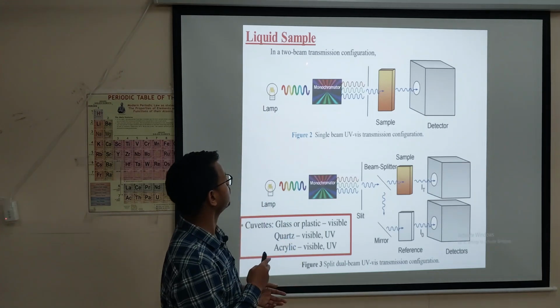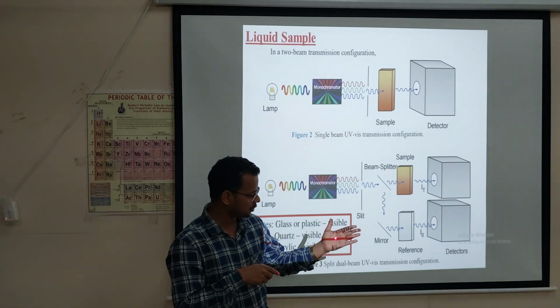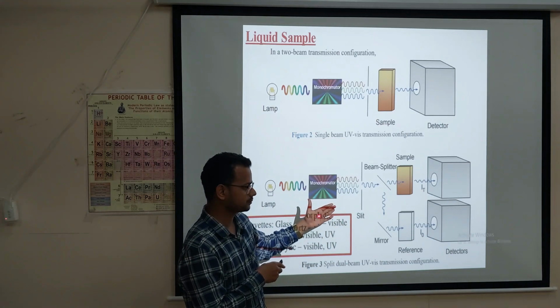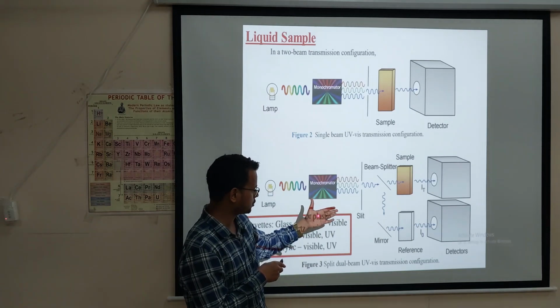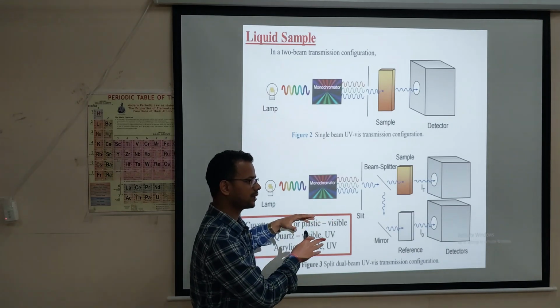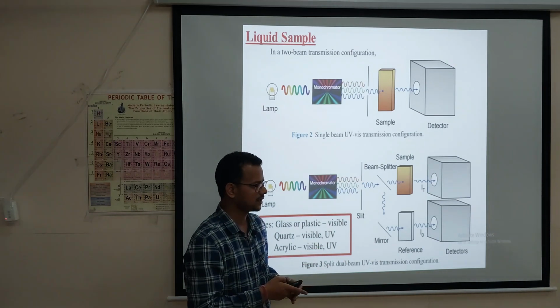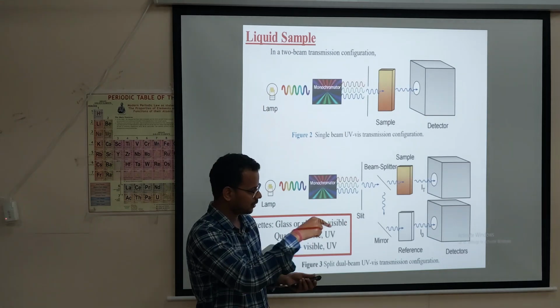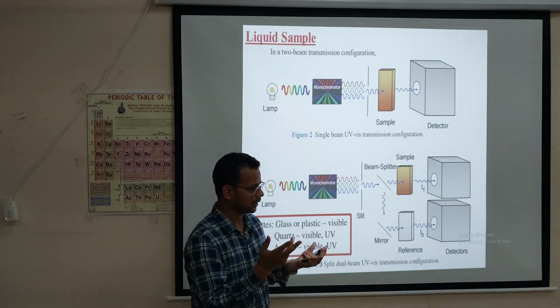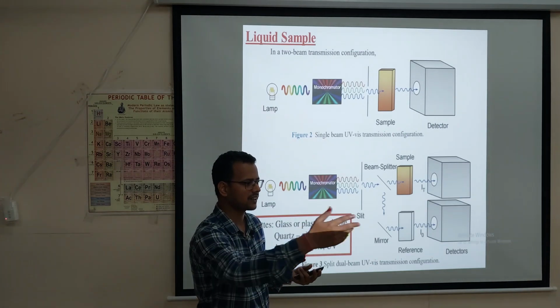Nice question. If we do not use a monochromator, when a single light source strikes here, are you able to see at which point it strikes? If we use a torch completely, it will give maximum diffraction and reflection. Just think in the practical sense. If I give a very narrow incident light, the reflection and refraction will be completely clear: what is the intensity of the incident light, and how much is reflected and refracted.